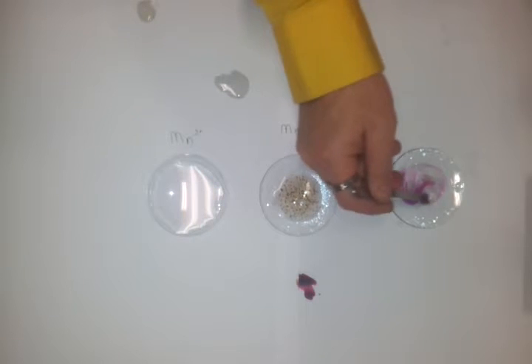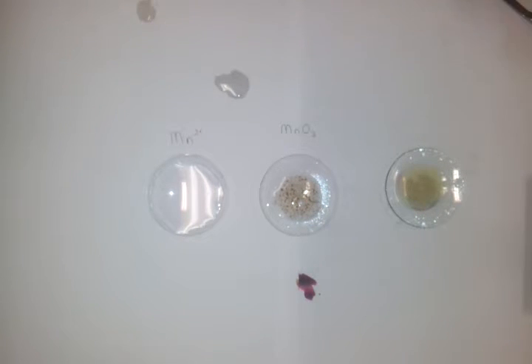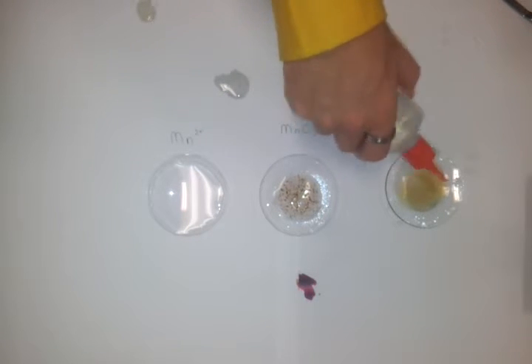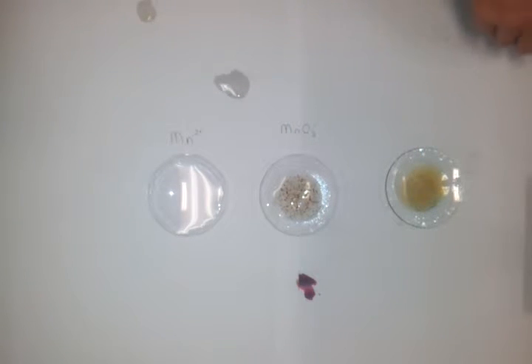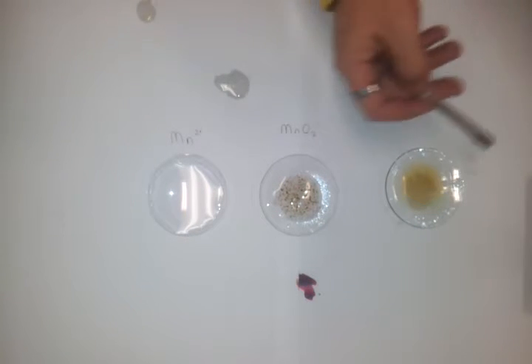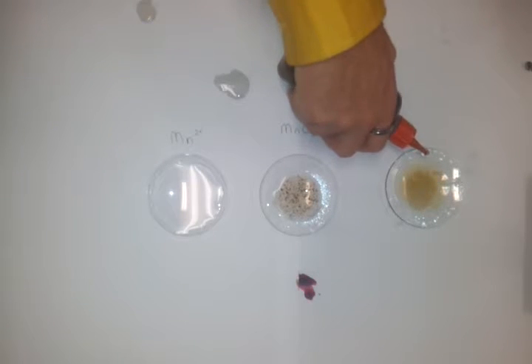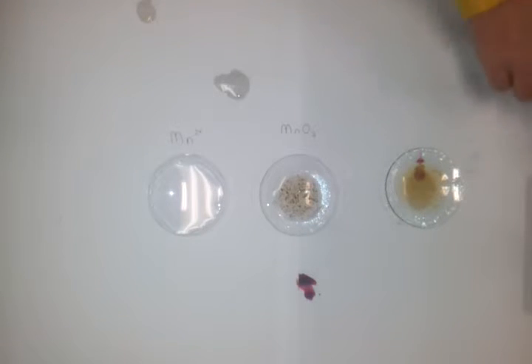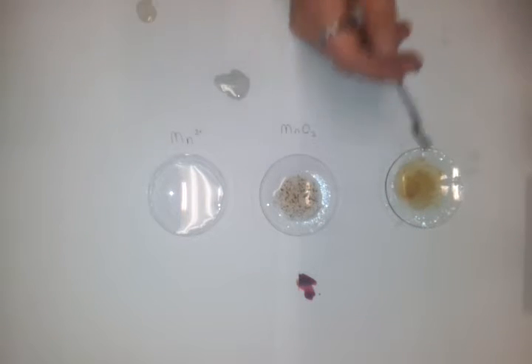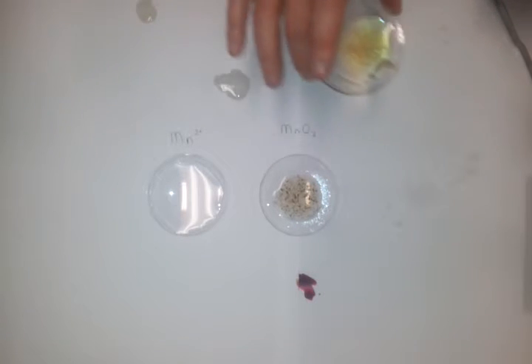And I'll add the, here we go. And that's what we expect. There's still some peroxide left in there, but I'll add a bit more so it happens. And we should see a bit of a green film around the edge. This is the one that I always find very hard to do, but if I add a bit more permanganate to it, we should get a little bit of green colour at the edge. It hasn't worked particularly well. It very quickly neutralises this reaction, so that's why it's hard to get right.